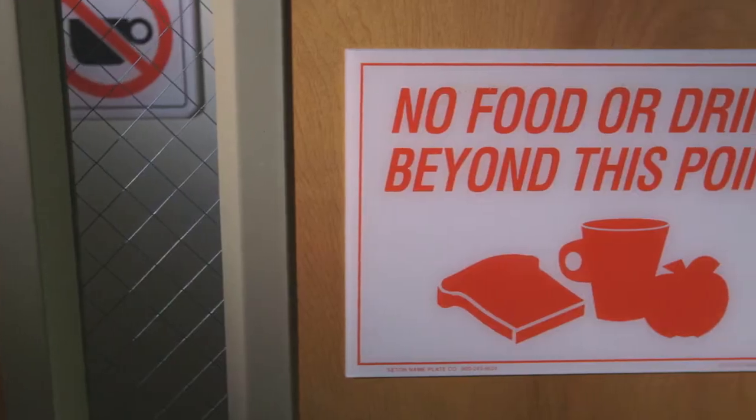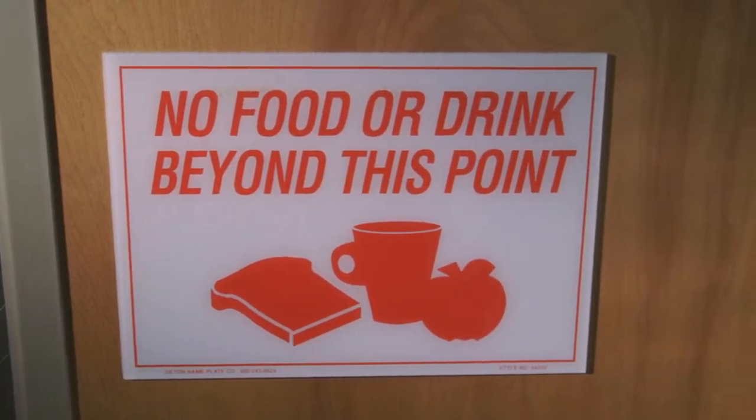Some of the material that we are going to manipulate in the lab are potentially dangerous for your health. That is why eating, drinking, and chewing gum are prohibited in the lab. Leave your food and drink bottles outside of the classroom or close them in your bag. If you want to drink, you should step outside of the lab briefly.